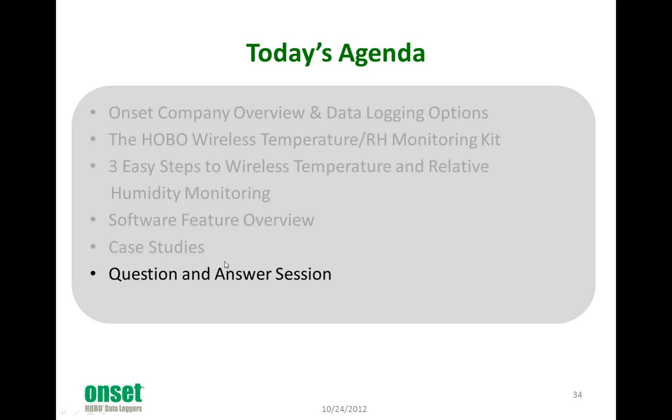You can then take that information and FTP it or have it emailed out to you, which is a great function. That way you can come in every morning and either have that email with your data, or have an FTP site set up at your location that will feed the data right in. The other option is if you have a VPN into that building, you can hop onto that local area network and grab and view the information that way.